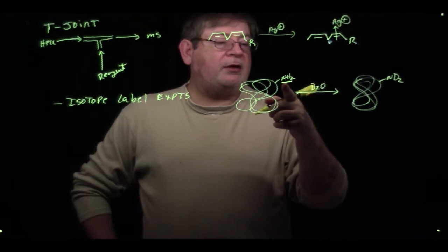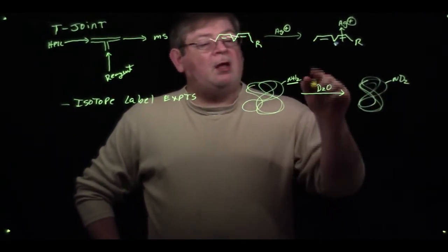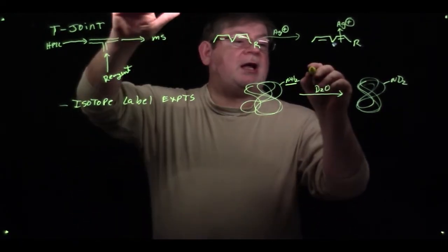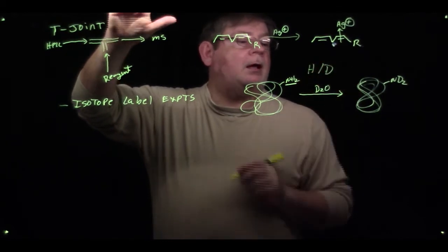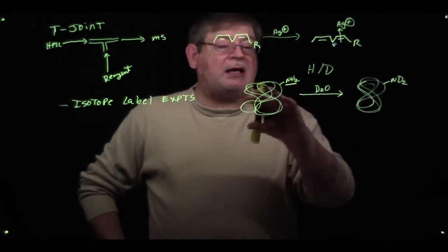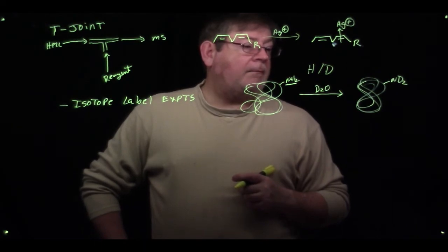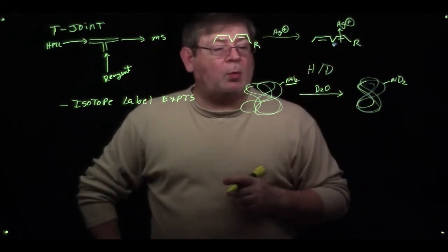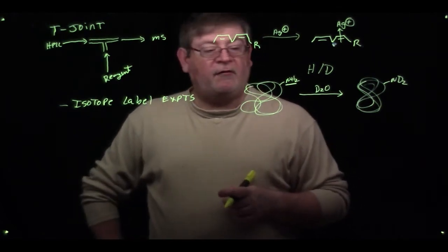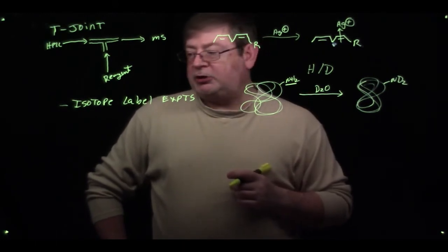You really wouldn't be able to tell the difference in just one residue being deuterated because the resolution's not good enough. But usually there are hundreds of different residues that can undergo this so-called HD exchange experiment, and you can look at the changing mass distribution and get an idea of what part of the molecule is exposed to the water and what part is embedded inside the fold. So you can do that with these so-called hydrogen deuterium exchange experiments.